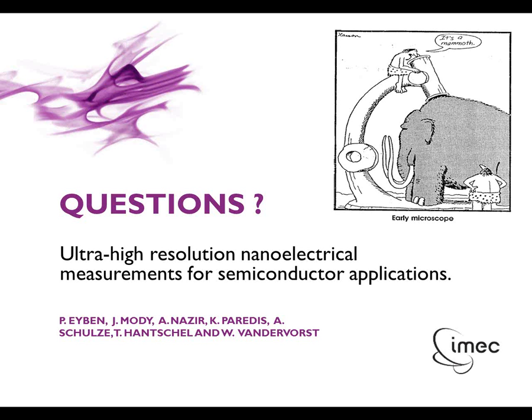I see a second question. Actually, the second question is regarding KPFM measurement. It's stated here that in KPFM, the measurement is based on a metal-metal interaction. However, when the sample is a semiconductor, one can still obtain a nice image, but can one then trust the measured values? Is KPFM quantitative when you use it on semiconductors? From my side, I would say, well, in KPFM, you measure a contact potential difference, and it'll be related to a difference in work function. But maybe Peter or Pierre, you have more comments on this, on KPFM for semiconductors?